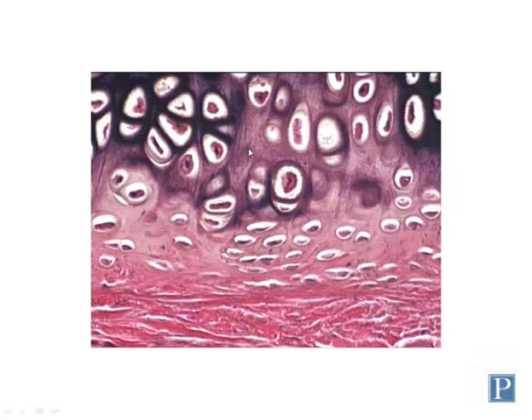Elastic cartilage that hasn't been stained to show the elastic fibers looks very similar to hyaline cartilage. So if we show you elastic cartilage, it's always going to have been stained in this way. So if you can see these elastic fibers, you know it's elastic cartilage. So again, here you can see mature elastic cartilage. Here's the chondrogenic zone that contains chondroblasts, not chondrocytes. Notice the cells are smaller and packed closer together, and then again the perichondrium here.